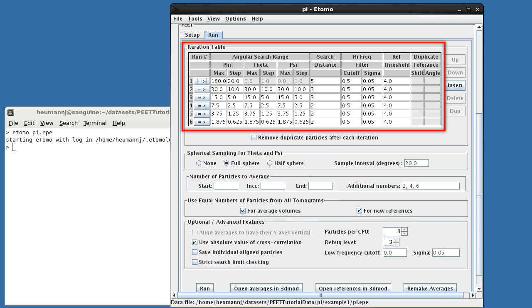Scrolling down, we come to the Iteration table, which is one of the most important PEET controls. PEET runs typically proceed iteratively, with alignments using successively finer angular steps at subsequent iterations. At each iteration, a new reference is generated for use in the following one.